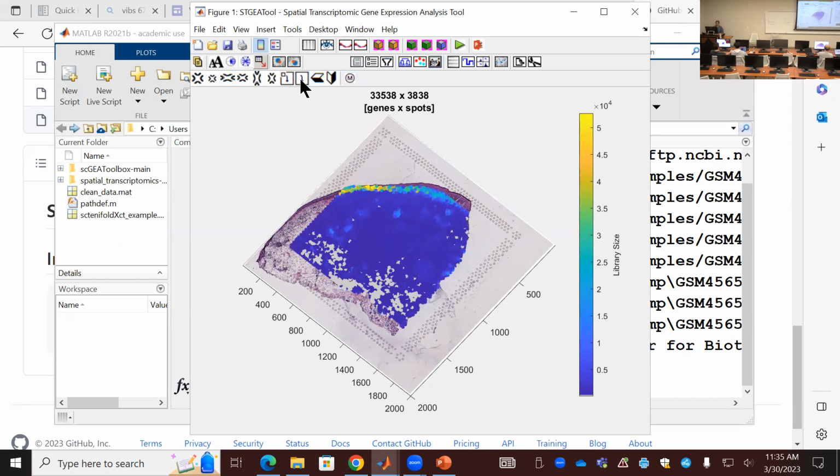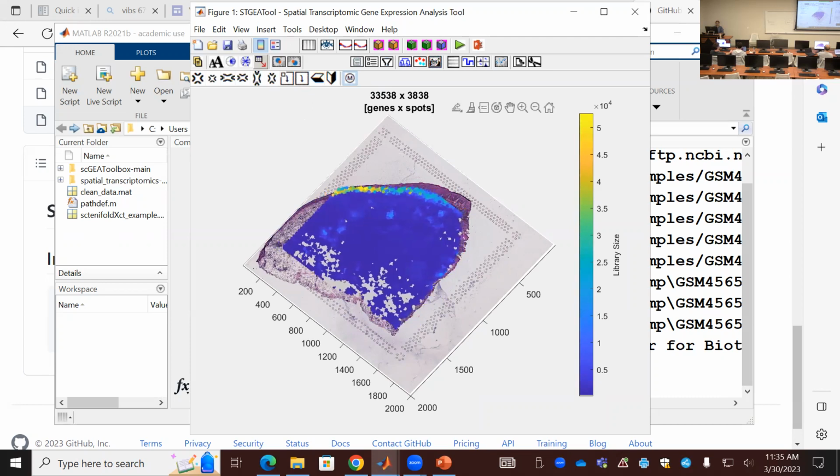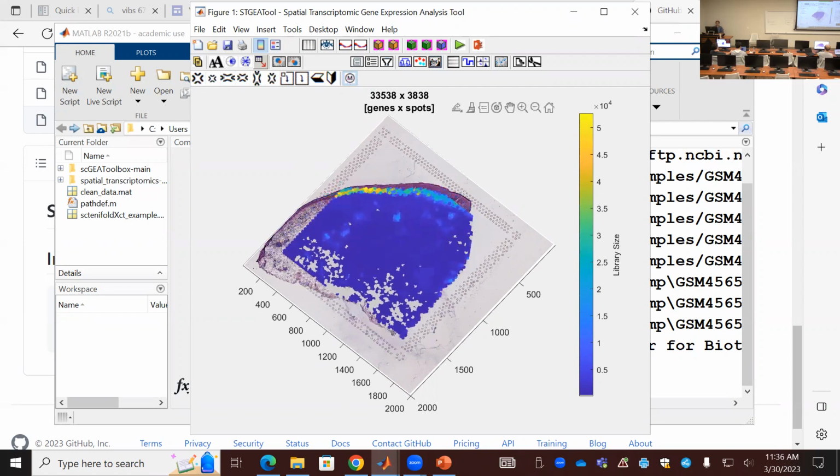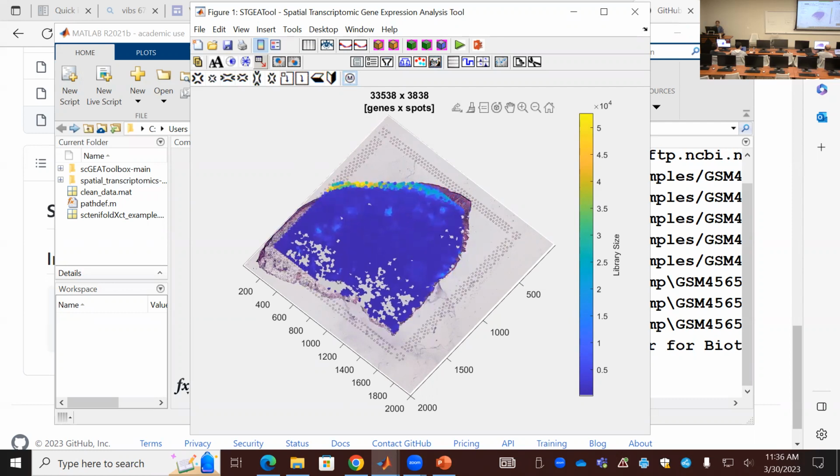So I did a flip and a rotation to match. And then probably I have to zoom a little bit. Yeah, it's very difficult sometimes. And once you finish, you can save the file. Next time you don't have to do that again.